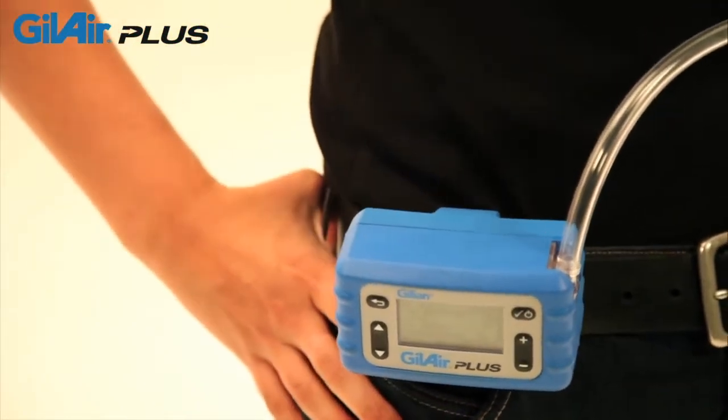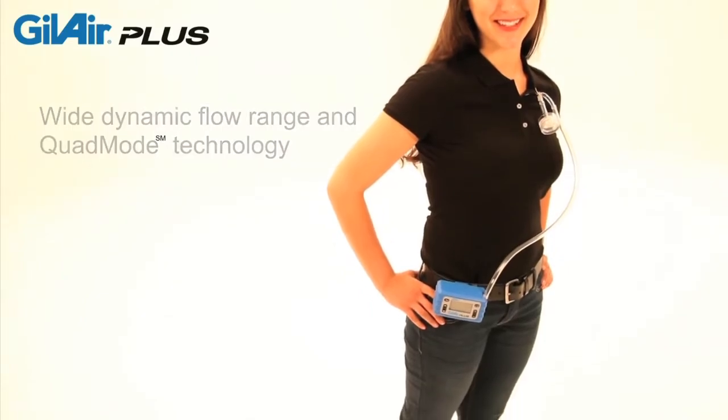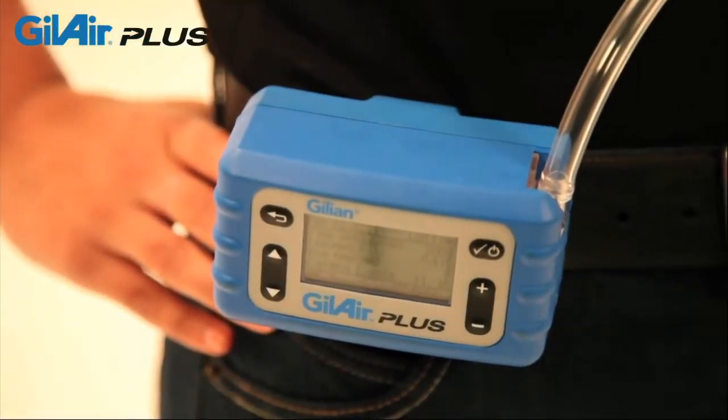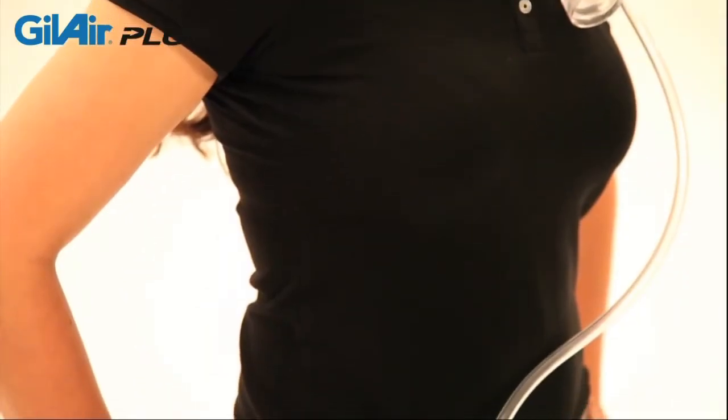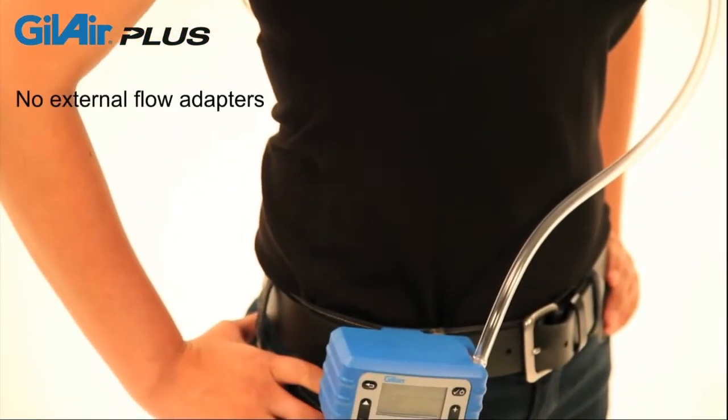GillAir Plus has the widest dynamic flow range of any personal air sampling pump. It is the first pump to offer quad-mode air sampling technology that enables constant flow of 20 to 5,000 cc per minute and constant pressure sampling in low and high flow modes without using external adapters.